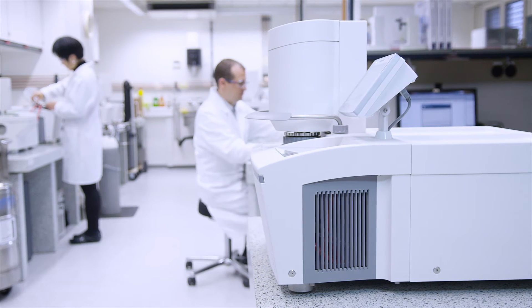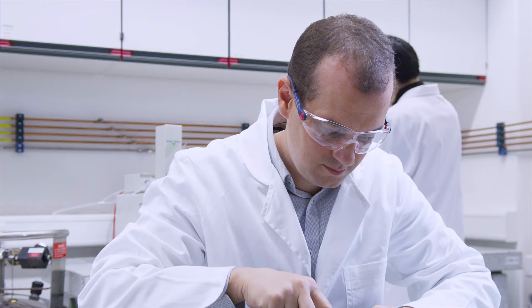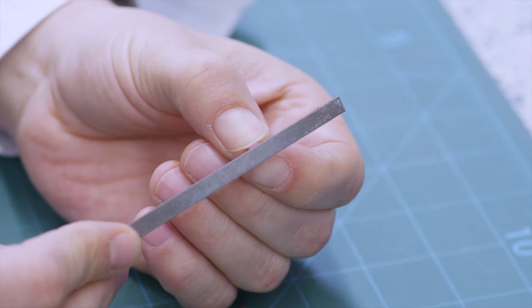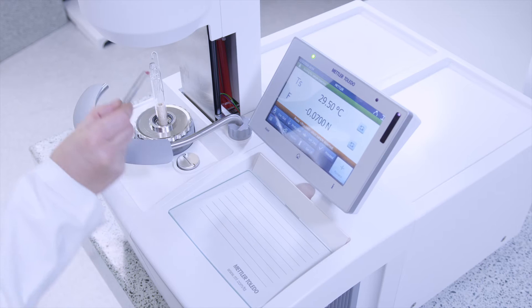Thermo-mechanical analysis, or TMA for short, is used to measure dimensional changes of a material as a function of temperature or time. Mettler Toledo's TMA-SDTA2 Plus is an excellence premium line instrument which offers outstanding performance for a wide range of applications.